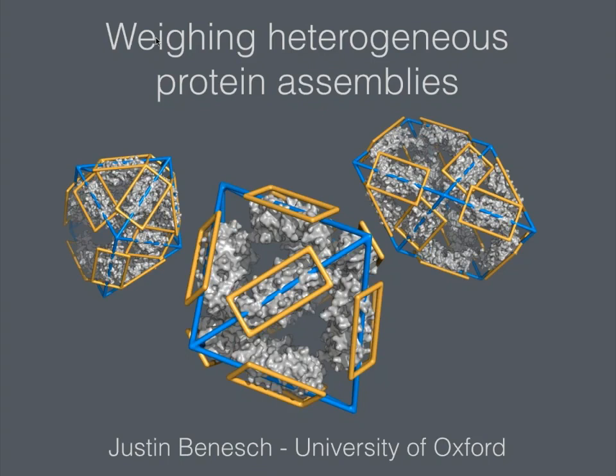Hi, I'm Justin Benesch. It's my real pleasure to talk to you today about what I've titled Weighing Heterogeneous Protein Assemblies, by which I mean actually measuring the molecular mass of proteins and protein assemblies and how they interact with each other and other components of the cell.